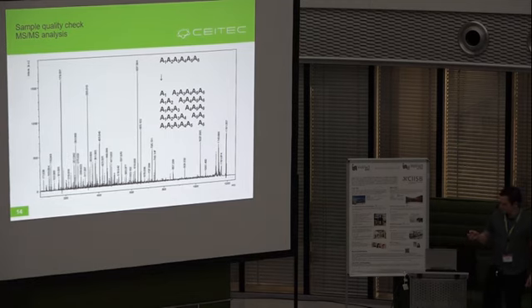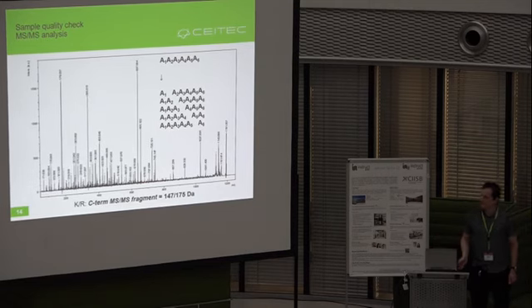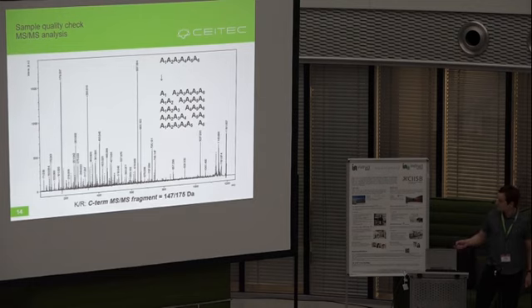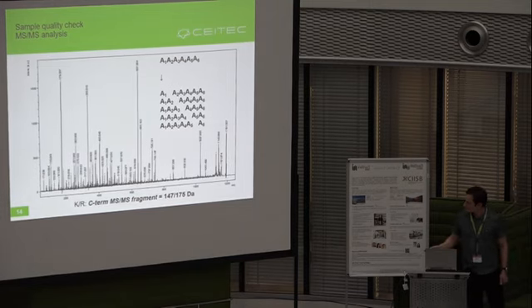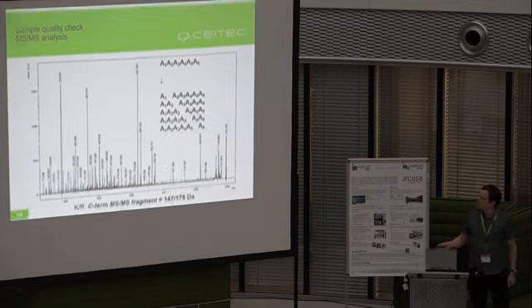However, there are some exceptions. In this case, we didn't find any reasonable difference between the masses. Even the principal fragment that can be found in every MS data obtained from tryptic peptides, when they are finished by arginine or lysine, you always see some of these 2 signals, but here they are missing. Instead of 175, we have 179.